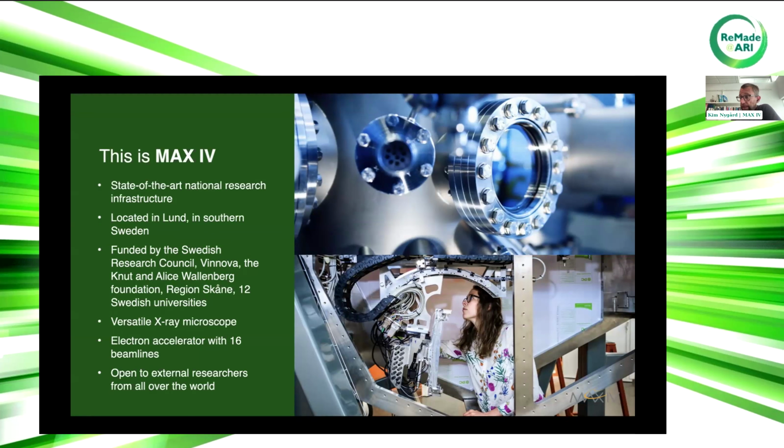And it's funded by both public and private money, including a large number of Swedish universities. Without going into details, you could say it's a versatile X-ray microscope where external users or researchers can come to carry out experiments to understand the materials they're working with.